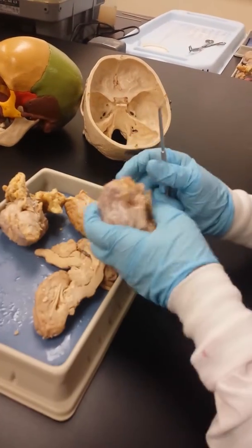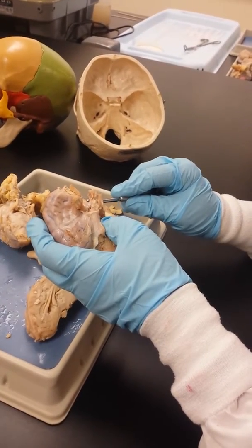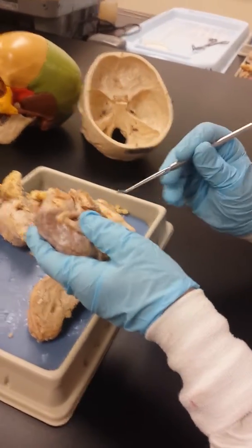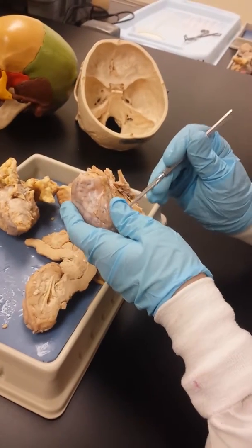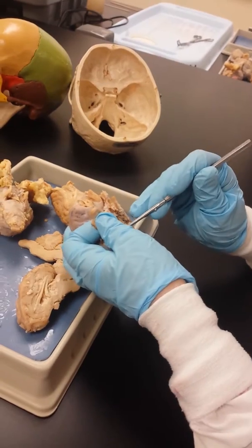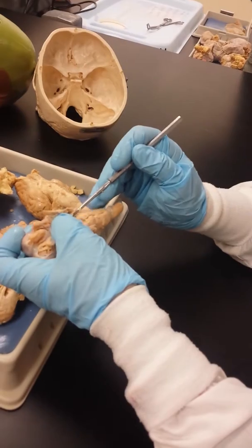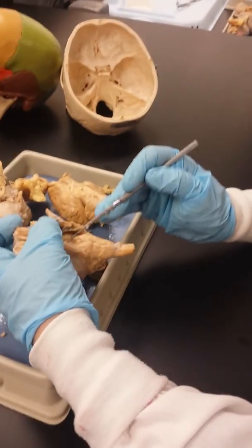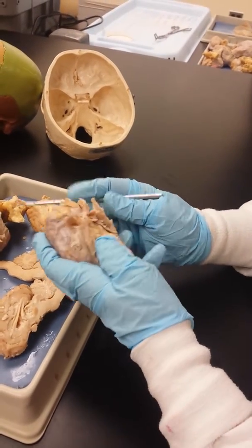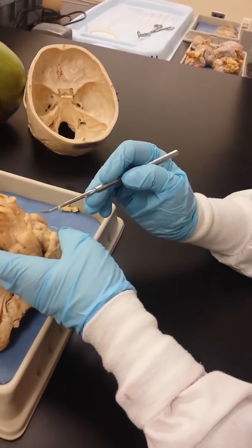Now, there's one other nerve you guys have to find. I know you have to find the olfactory bulb. I know you have to find the optic nerve and the trigeminal nerve. There's something else. Oculomotor. Is it the oculomotor? Has anybody found it and thought it was really clear for you guys? There it is. Can you see it? Coming right off of the top of that midbrain. Normally you can see it on each side, but it's been cut. Yep, there's two, one on each side.